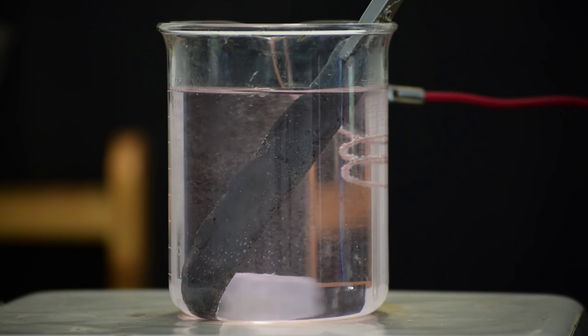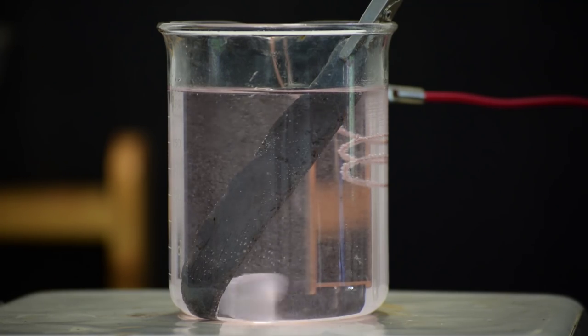When the power is applied, bubbles will begin to come off of each electrode, and the lead electrode will begin to darken as it is coated with lead dioxide.